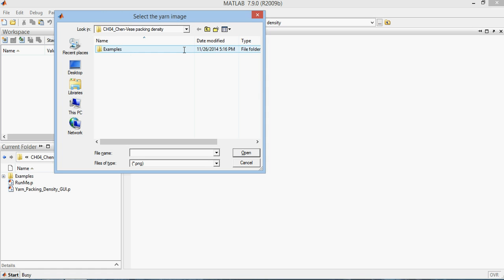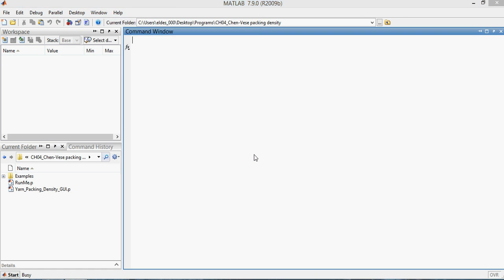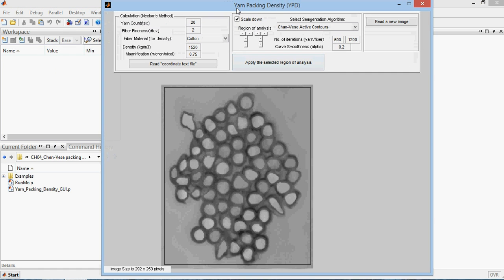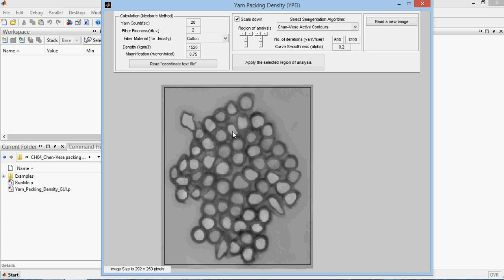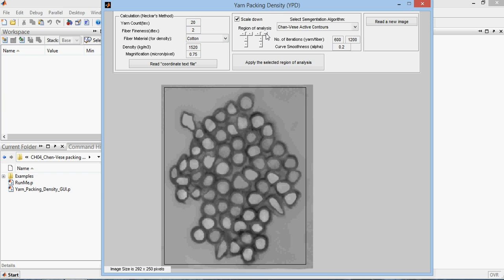The program starts by asking about the yarn cross-sectional image, and you can find some examples here. I'll just choose this one. As you can see, this is the interface for the program. The image of the yarn cross-section is shown here, surrounded with this rectangle that you can control through these elements here so I can assign the exact area of analysis.